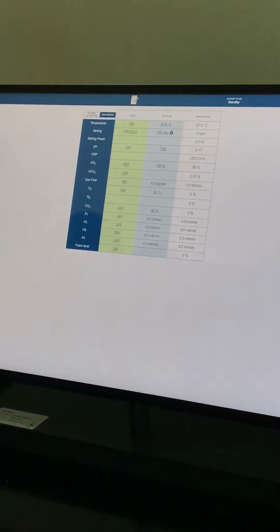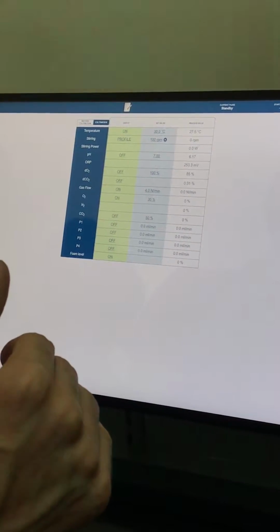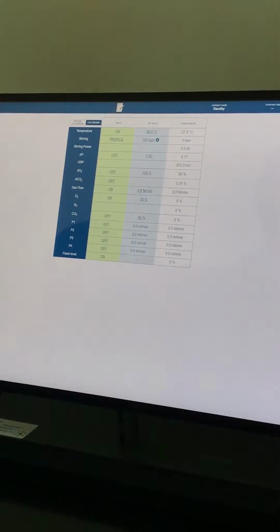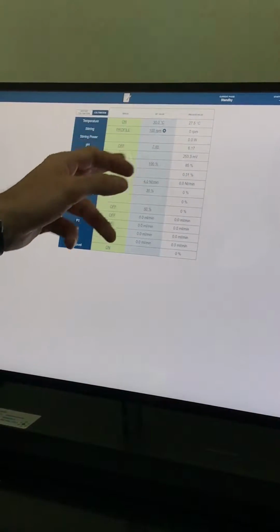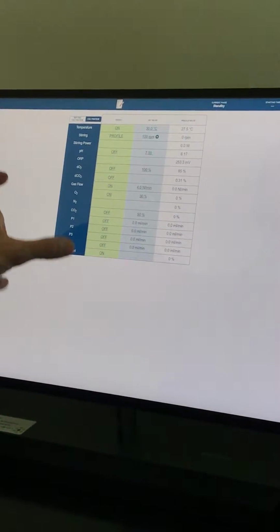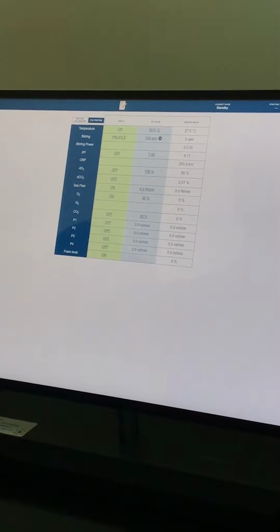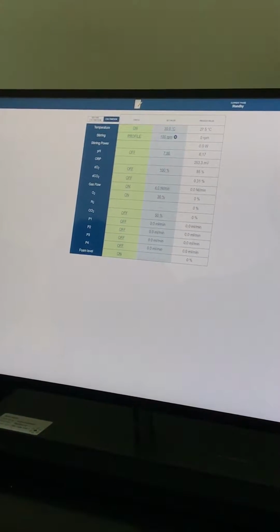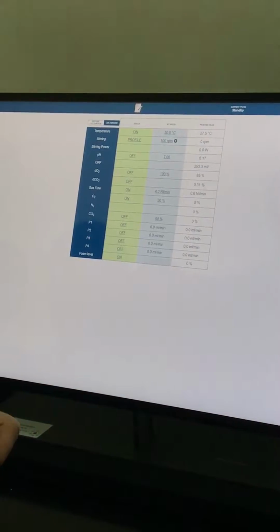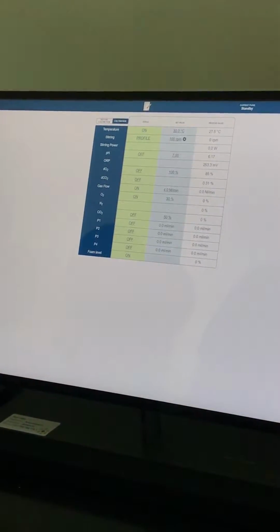Okay. To the cultivation table where there is all the process. You automatically switch to the cultivation table where there are all the parameters during the fermentation. You can tell the software, okay, now keep the temperature at 30 degrees, the stirring at 200 RPM. In 1 hour, you will increase the stirring to 500 and so on, all the control.